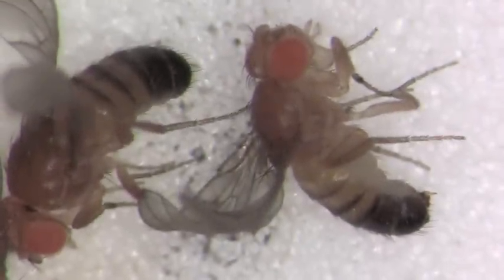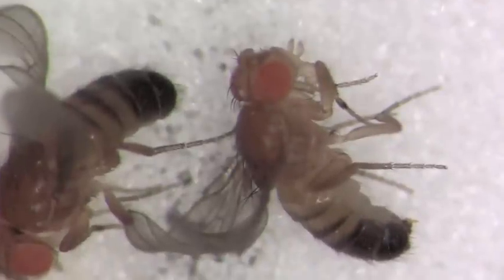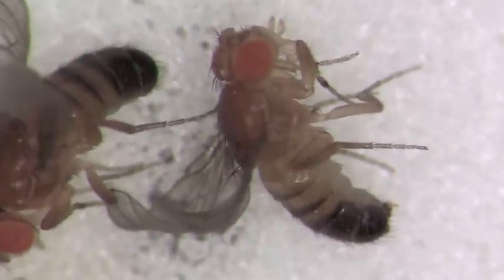You can also see the sex combs on the front pair of legs of the male in this shot.